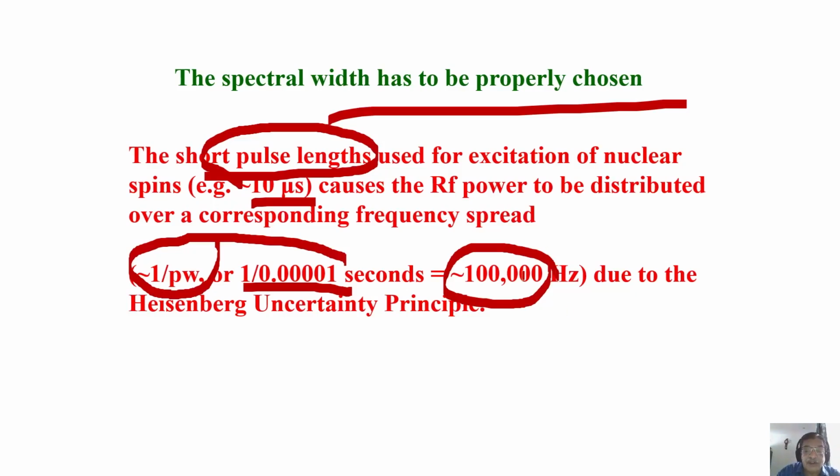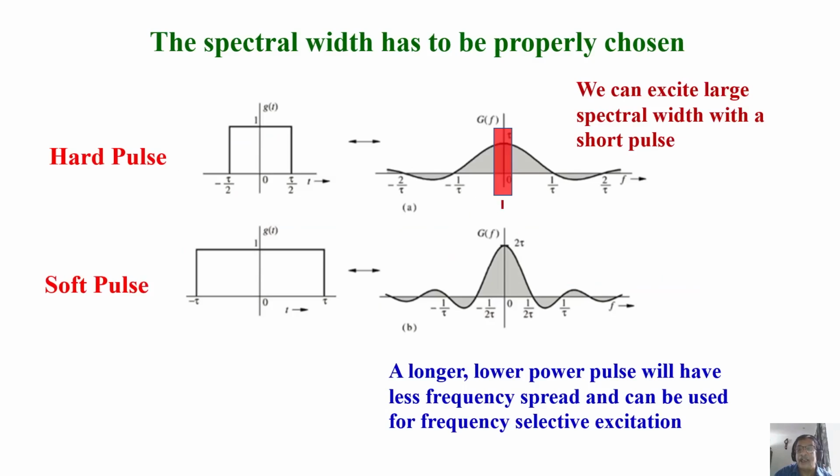You have to find out where the profile of that is, called the spectral. This is after Fourier transformation, you are going to get this type of thing. This is what you are going to see, and this is the region where the excitation profile, the power, this thing, this is called power spectrum. This has to be exactly uniform. In the power spectrum, you see, supposing you are going to excite in this region. If your spectral width is like this, in which case you have to have a carrier offset, carrier frequency. Your carrier is here, and look for 1000 hertz or 5000 hertz, whatever your spectral width is here.